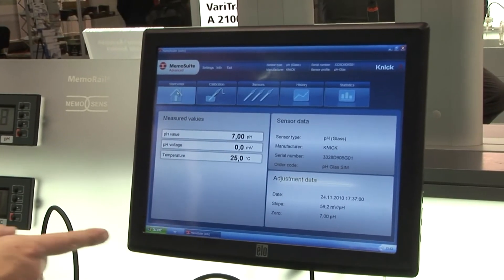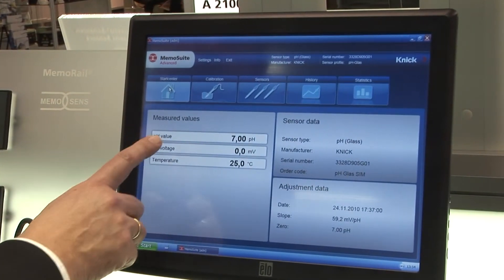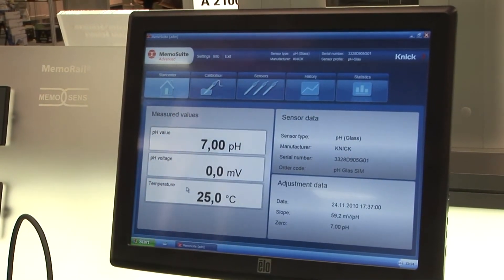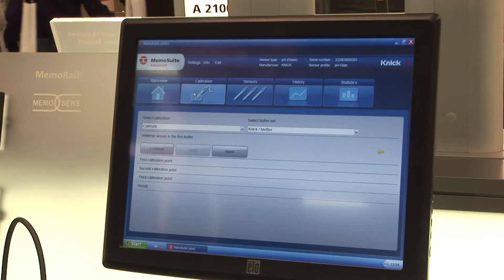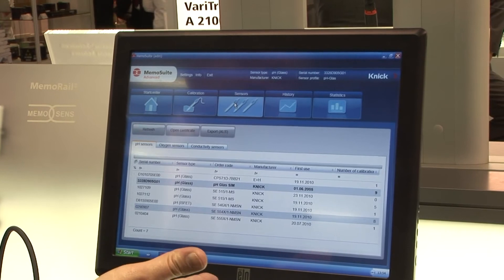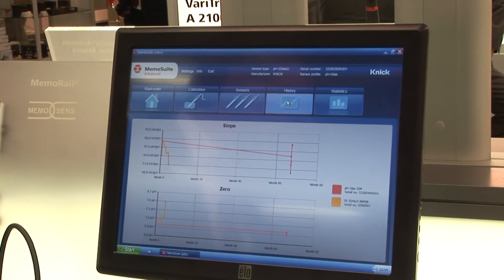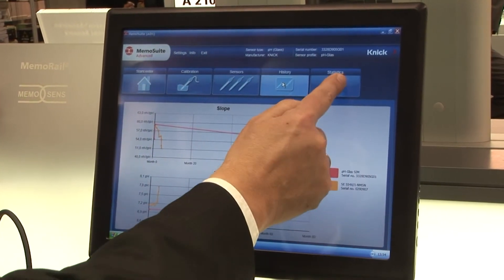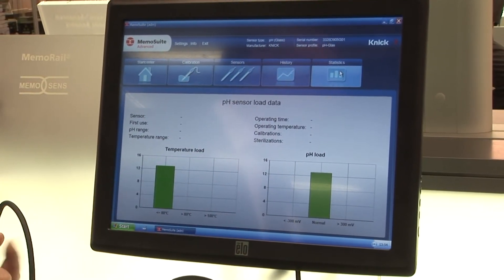This new human-machine interface is MemoSuite, and with MemoSuite you have very simple operation. You can display the values, you can calibrate, you can store the sensor data, you can display the different sensors, you can display the history of calibration — sensor slope and zero over time — and you can report statistics such as pH or temperature load for predictive mechanisms.